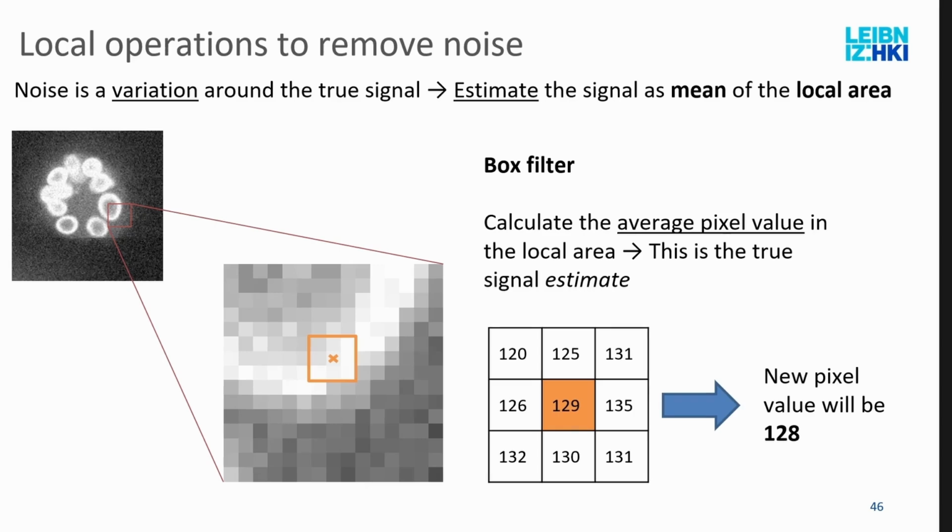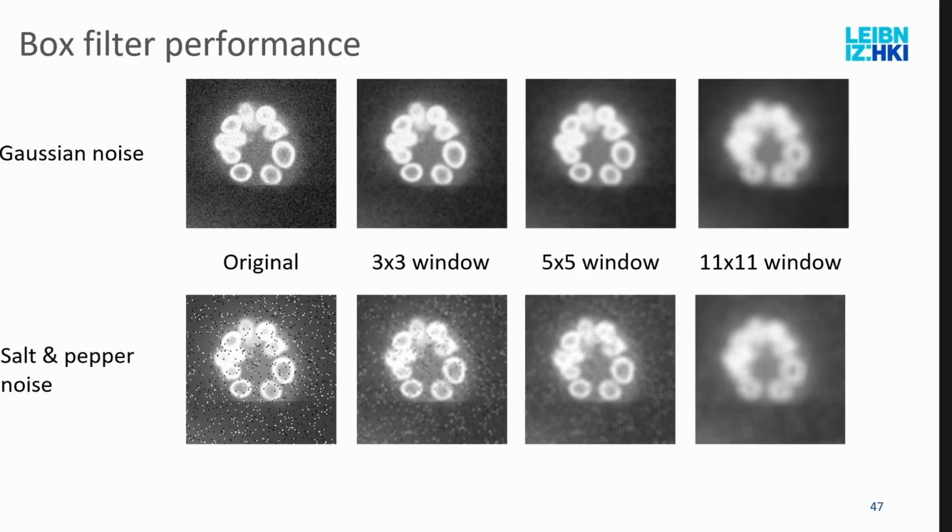But if a cell is half over the border, your brain infers, okay, it's maybe like that, but you don't know. So you rather remove it than ruin your statistics. And anyway, you have so much statistical power on a general microscopy image that you have enough data to remove something where you're really not sure. There are filters that handle it, but they are very tool specific.